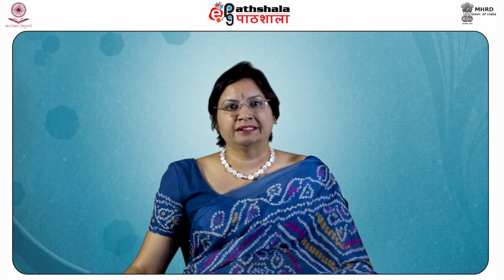So after being aware of how the samples collected from the arson scene are analyzed in the forensic science laboratory with the help of GC and capillary GC, in the next module we shall understand how to use all this knowledge for the management of arson cases. We shall study the various occupational standards for crime scene management, which include the standards and the assessment protocols, and how the management of these cases is done. We shall also study how to deal with arson crime scene management very effectively, and comprehend the various occupational standards and protocols used during arson crime scene investigation. And as a forensic scientist, what shall be your duties during the investigation and management of these arson cases?